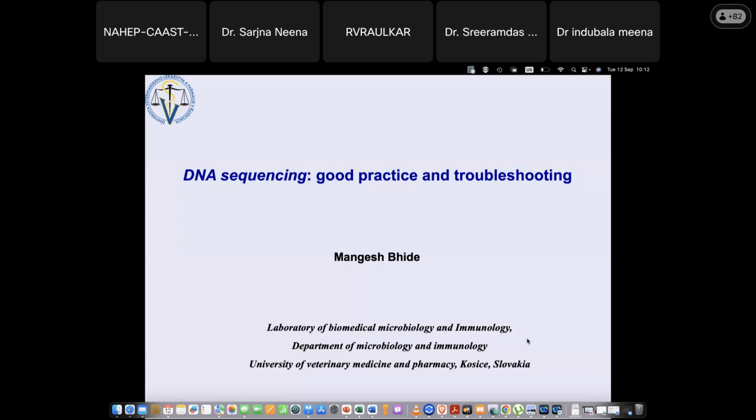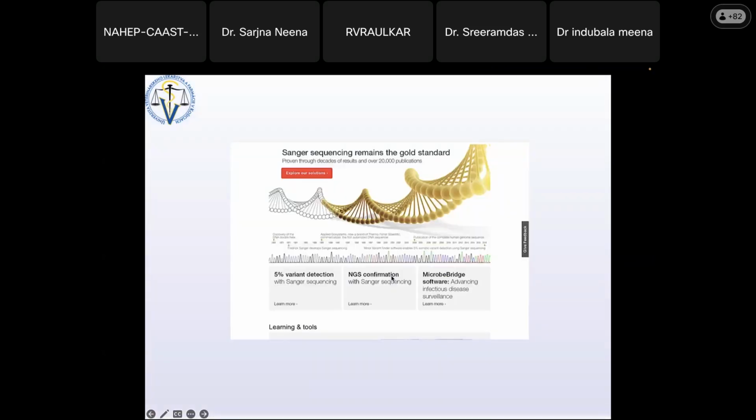So we will first see how DNA sequencing works and why we need DNA sequencing when there is NGS, next generation sequencing, why we need Sanger sequencing. DNA sequencing still remains one of the most used experimental approaches in molecular biology after the SDS-PAGE.